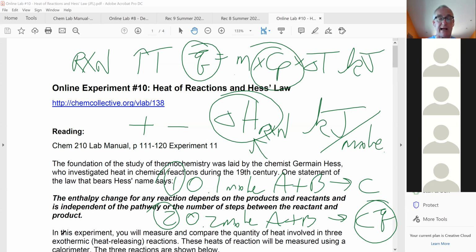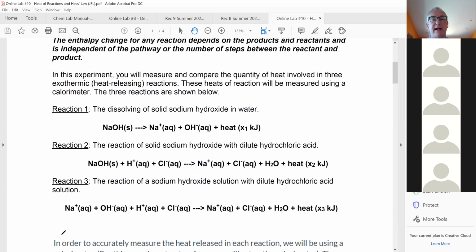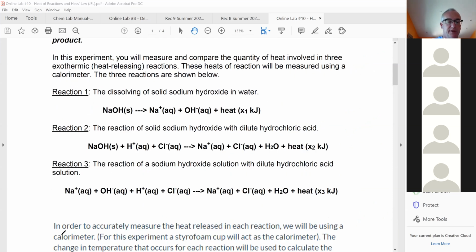So let's look at the reactions we're going to be doing today. It's 3 reactions. So here are the 3 reactions we're going to do.